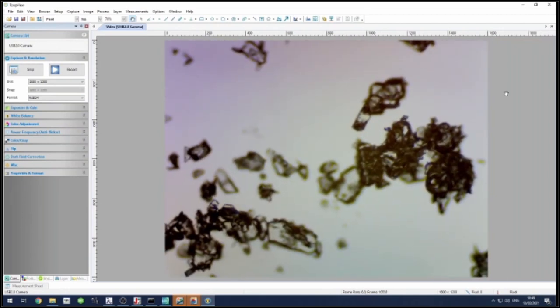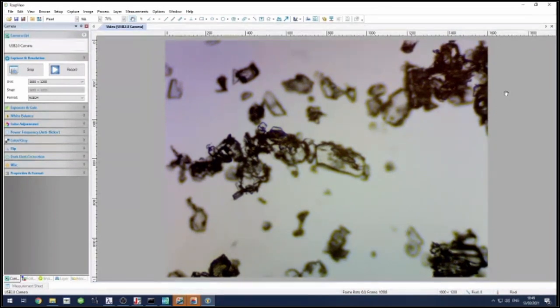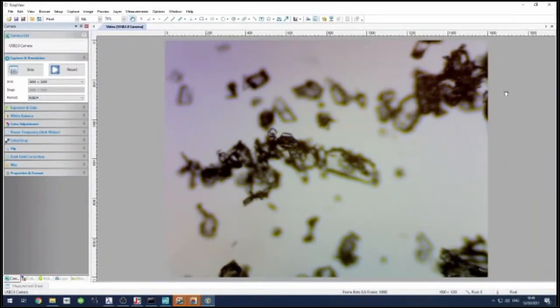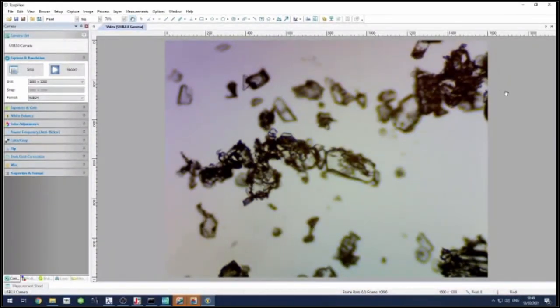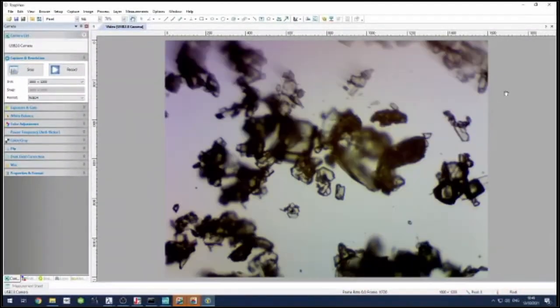This is what the samples look like when we deliberately monitor and control and slowly cool the solution over time. We can see there's very clearly defined crystals present. And so this is why we want to control our processes. It would be nice if we could control the processes in line, just by looking at how the process is progressing in real time, rather than having to extract samples and prepare slides and so on.